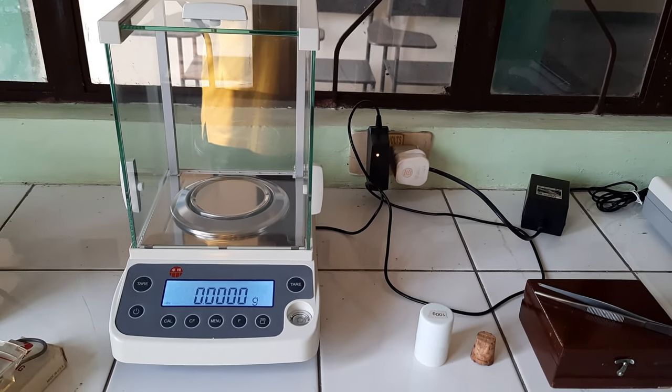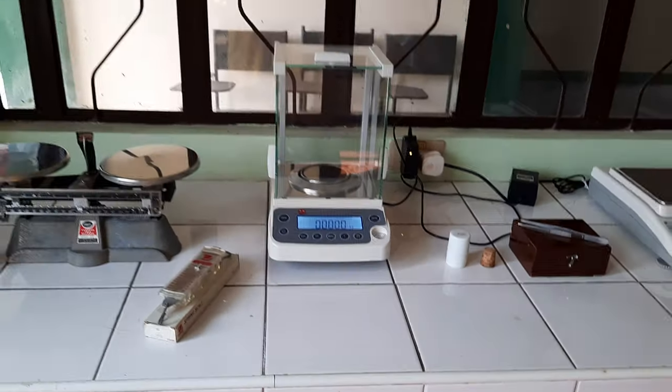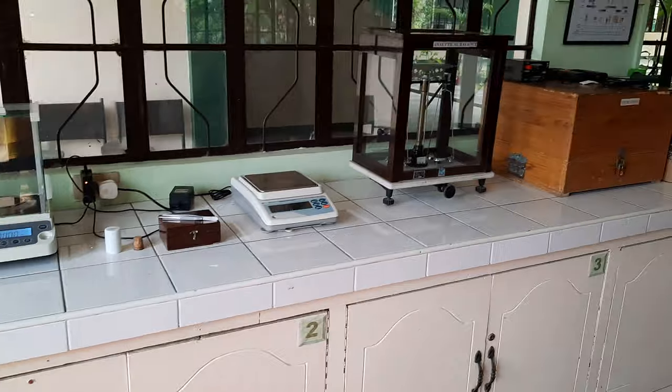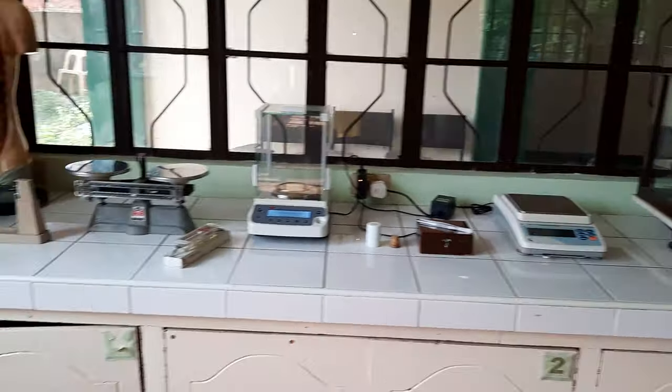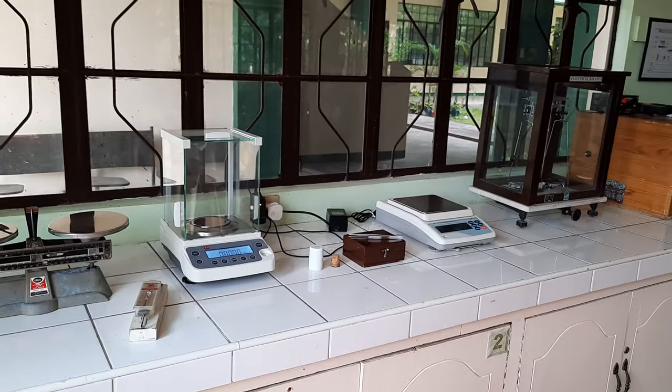It can measure up to one-tenth of a milligram. Once again, these are our weighing devices here in the science laboratories. Good afternoon class and have a good day.